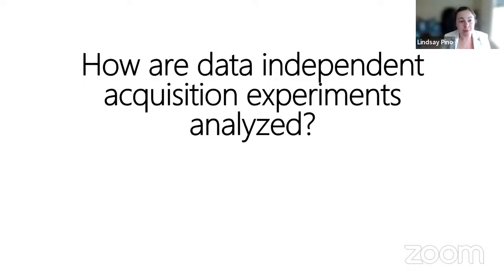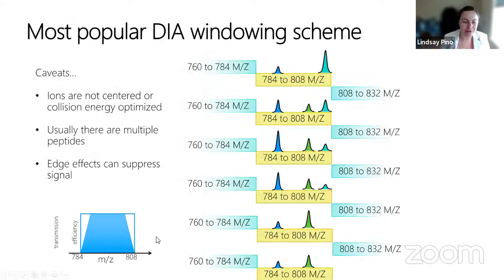Paul asked, do measurements for peptides that exist right at the m/z boundary suffer? Yep, exactly. That's that quadrupole transmission problem. DIA researchers try to get around this by using what are called forbidden zones. Based on average isotopic distributions of peptides, you can theoretically calculate where there cannot possibly ever be a peptide.